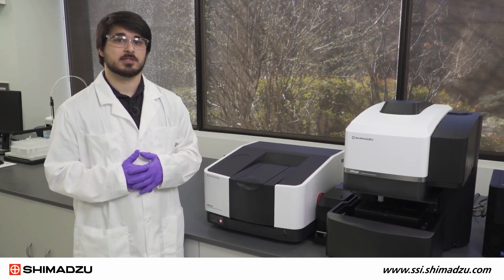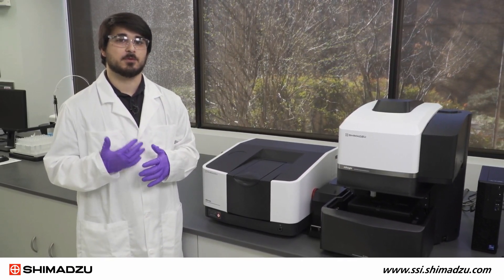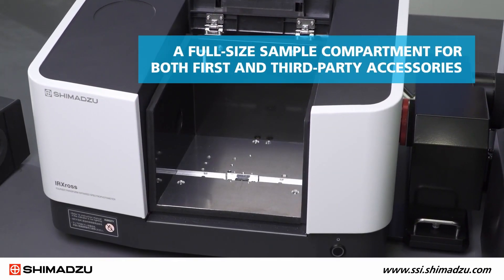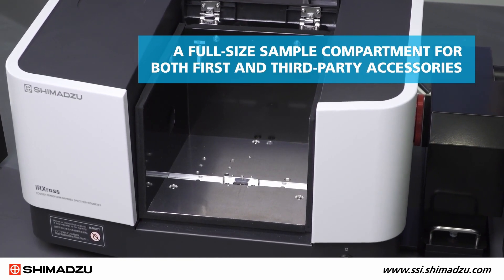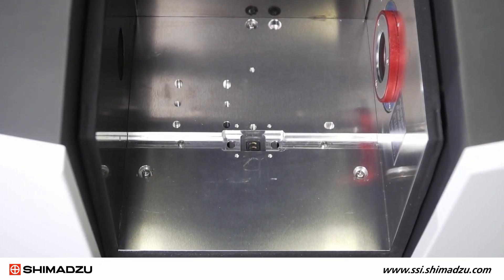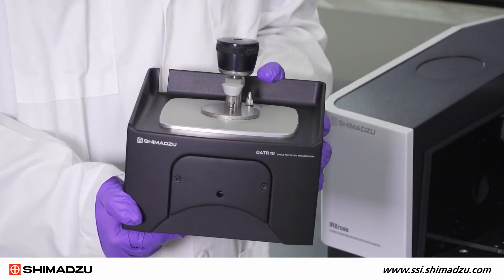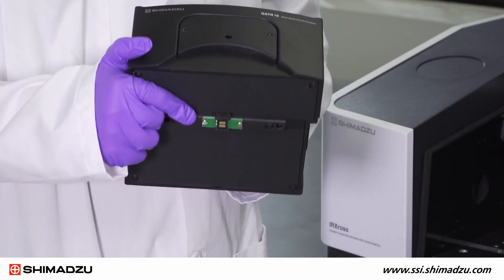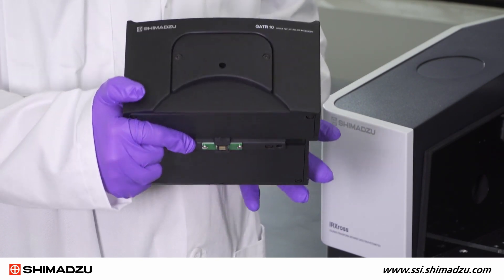The IR CROSS is a mid-IR spectrometer with a range of options to fit the needs of most laboratories. It has a full-size sample compartment to allow both first and third-party accessories. The bottom of the sample compartment has a sensor for the quick start accessories, which enables the IR CROSS to recognize your accessory and load preset measurement parameters for that specific accessory.